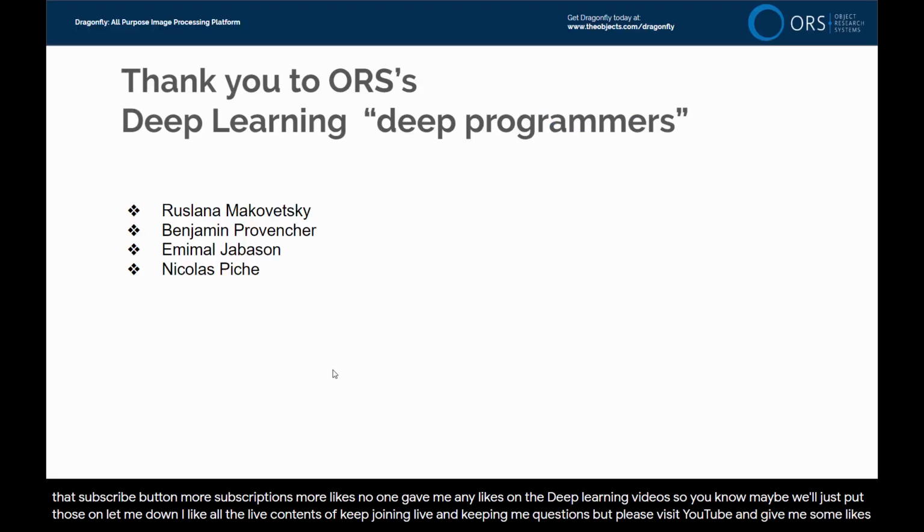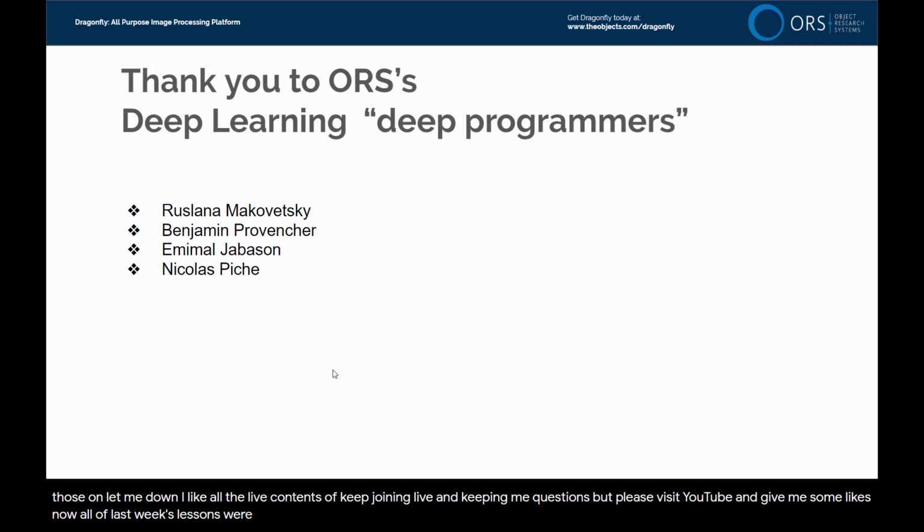Now, all of last week's lessons were on deep learning, so we had one theoretical lesson and then 4 practical lessons spanning the applications of image segmentation, denoising, super resolution, and then some advanced topics.